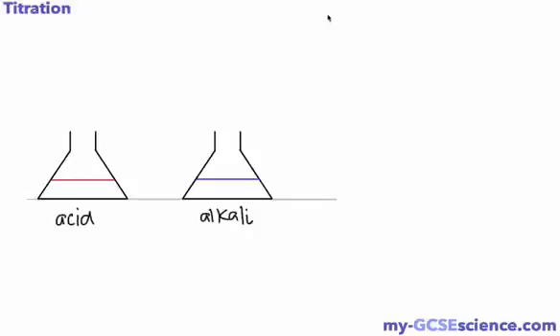Hello, for today's video we are looking at titration, and I've broken up the videos into two. The first one is about the method of titration, and the second one is about all the calculations that you may be required to do for titrations.